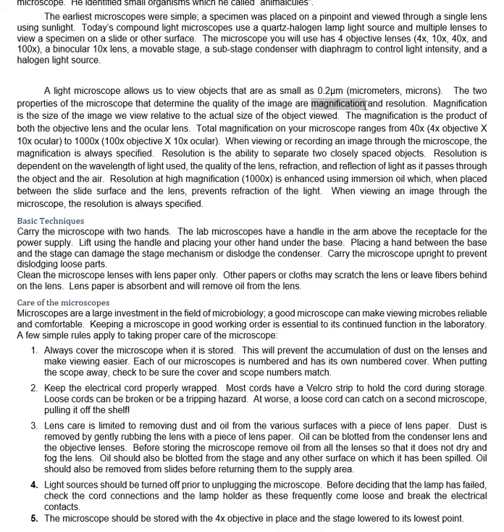So we need things to be magnified. We need them to look bigger than they really are. But they also have to have resolving power, because if we can't distinguish between two things, then they all look the same. Think of it this way: if you've ever been on a road and saw in the distance maybe trees, if you're so far away you can't tell the individual trees, it looks like one big mass. But the closer you get, the more they're magnified. You can resolve those and say, oh, that's one tree and that's another. And it's kind of the same thing with this bacteria that we're going to be looking at.